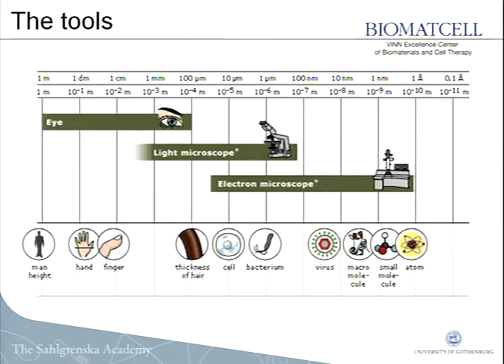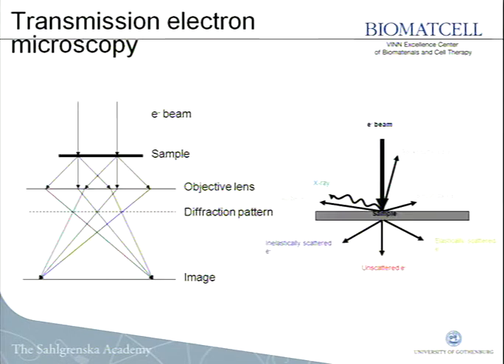That's the light microscopy. I want to expand on how to look with electrons instead, to get a better resolution and many different possible analyses of the interface zone. So what happens when you use electrons? They should be transmitted through the sample. There will be many different events occurring when the electrons penetrate and interact with the sample. You will have scattering effects, which could produce different contrast phenomena in the analysis.